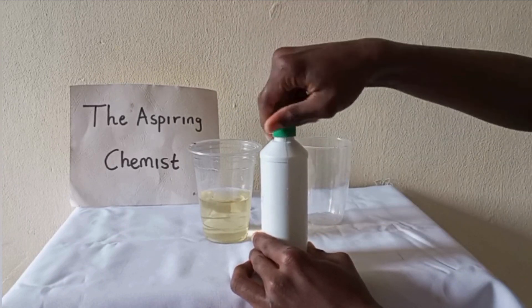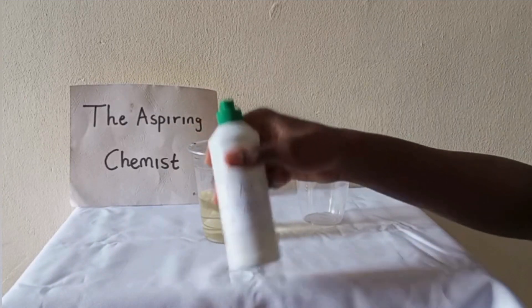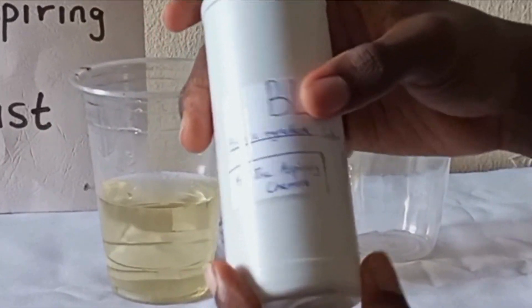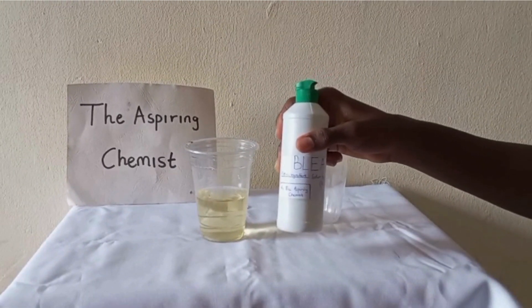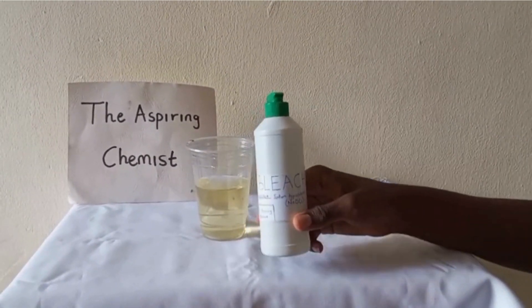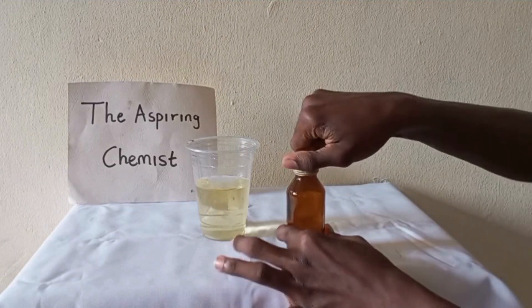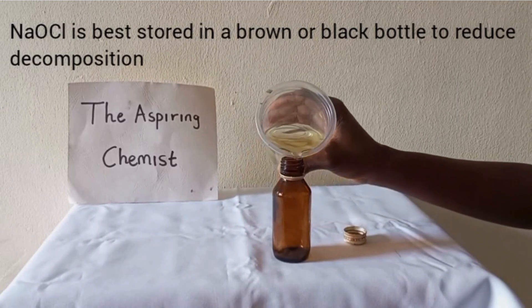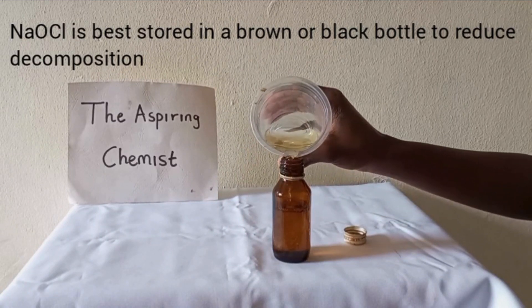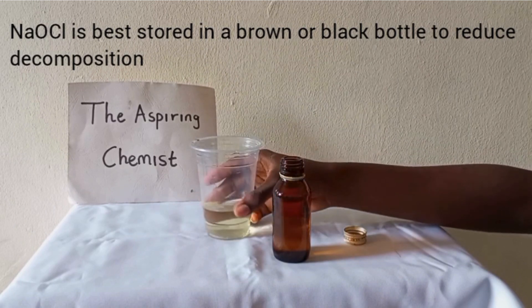But if you want to use it for laboratory purposes, there's no need to dilute the solution. Rather, just pour your bleach into a dark container like the one I'm using here. Sodium hypochlorite decomposes on the shelf, so it's important to store it in a dark container.